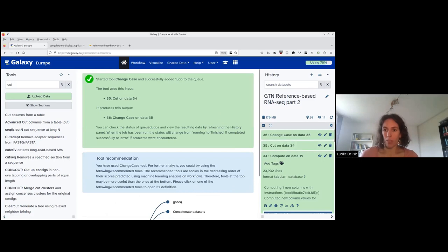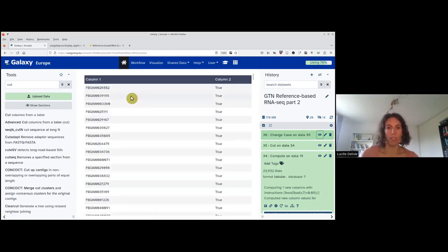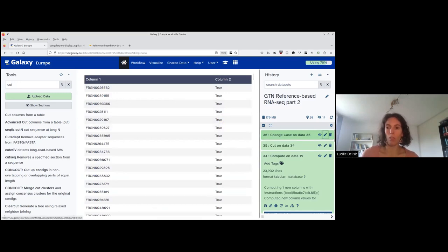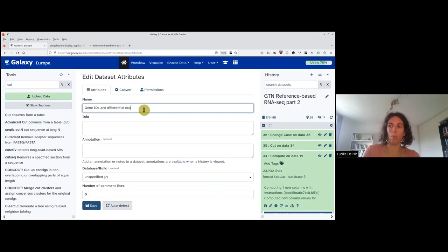Everything has run. I check the result with the eye: the first column has G IDs all in capital letters, and then true or false. I rename it using the pencil and call it 'gene IDs and differential expression.'